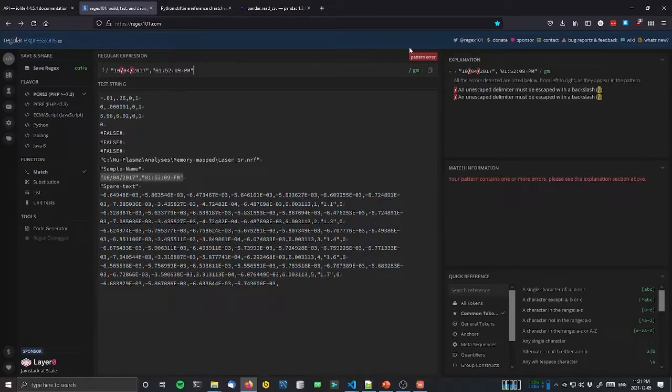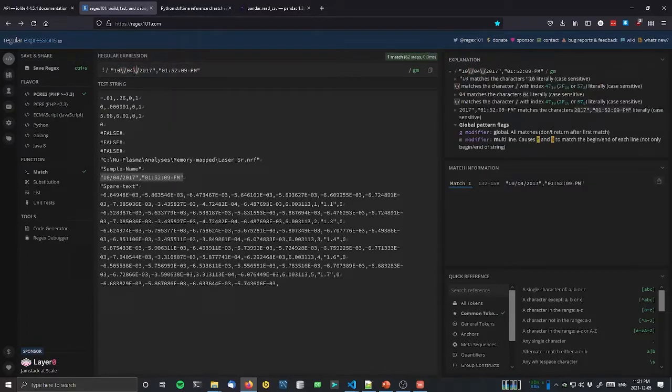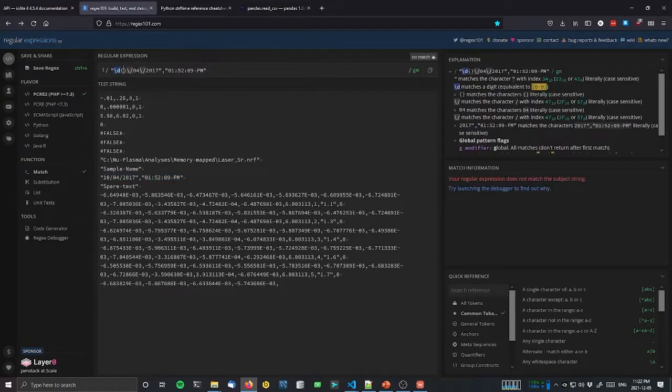And the first thing to do is say, oh, we've got a pattern error, and it highlights the pattern error for you. So that's why this tool is really handy. And if I hover over that, it says you need to escape these with backslashes. So I'll put in backslashes there, and it now is showing us what matches. So that's great. It's matching the whole thing. Then I start by just replacing any digits with \d and how many digits I'm looking for.